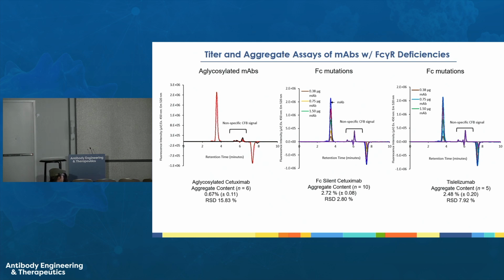We used a different color for the molecular recognition agent, so we get a different peak for that. So I was able to quantify it. The problem was, I haven't actually developed an assay that we can sell with that yet. It's all to be done.